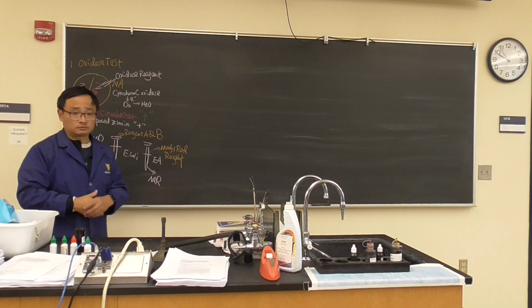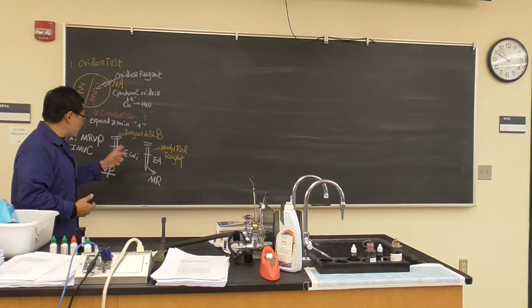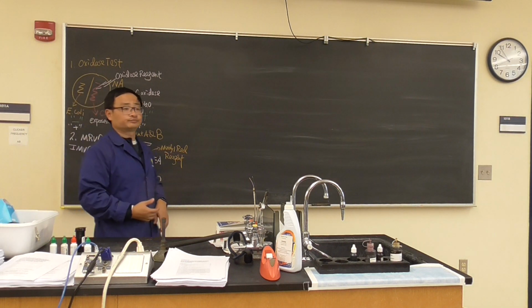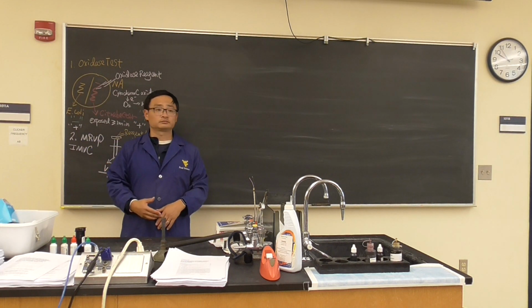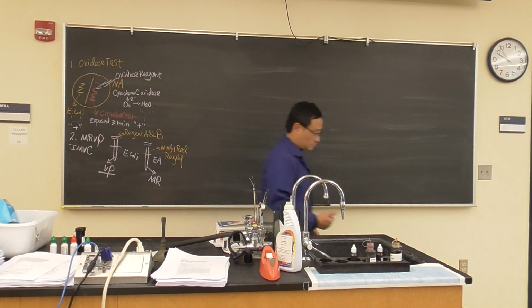So let's do it. Who has methyl red of Enterobacter? Just give one to me. Who has a tube which is methyl red Enterobacter? Okay, I have it. This is methyl red Enterobacter.